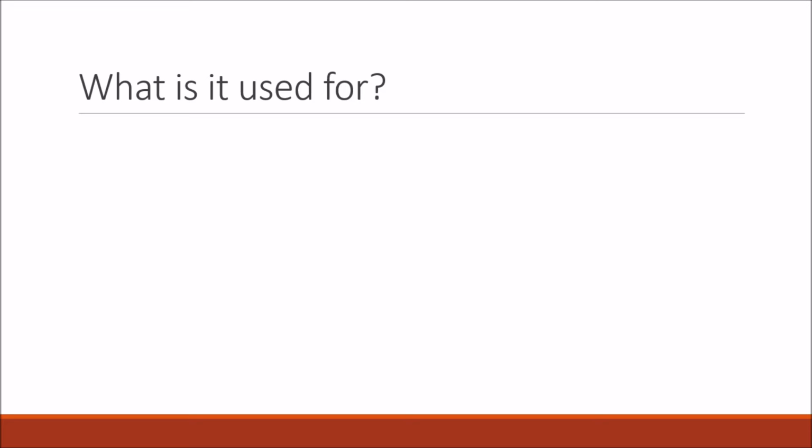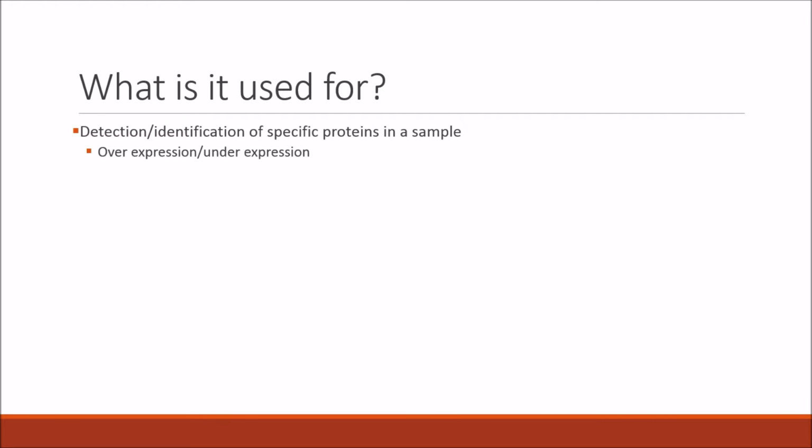So after doing all that, what is it used for? Well, it's mainly used for the detection and the identification of specific proteins in the sample. Moreover, you can then look for the overexpression or the underexpression of that specific protein.